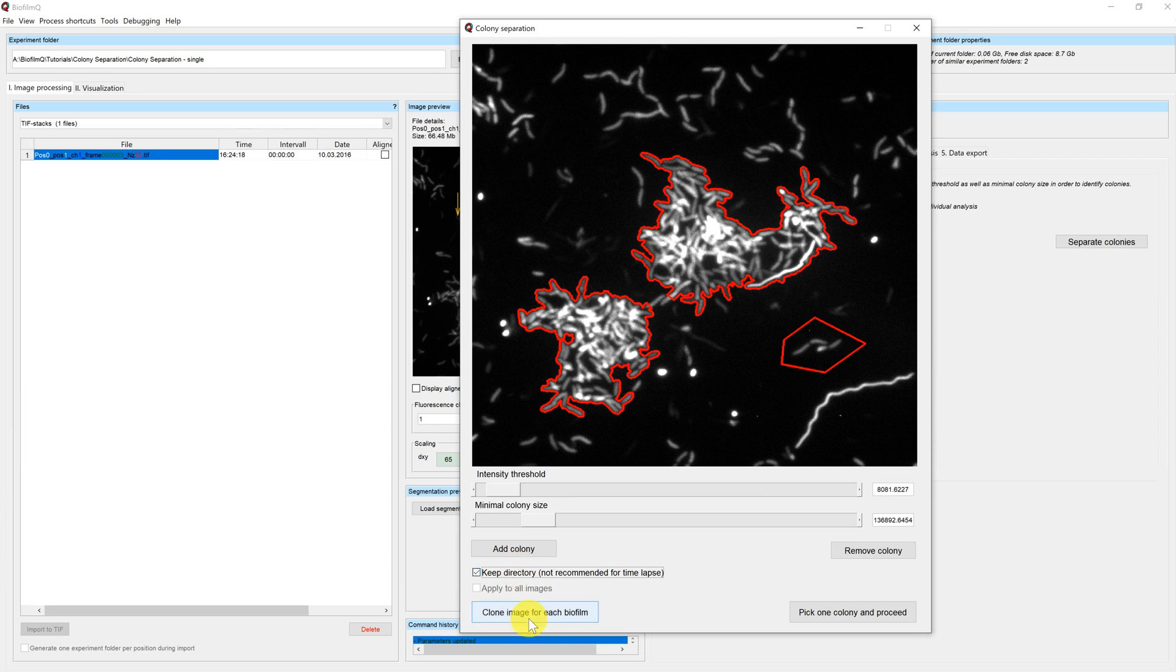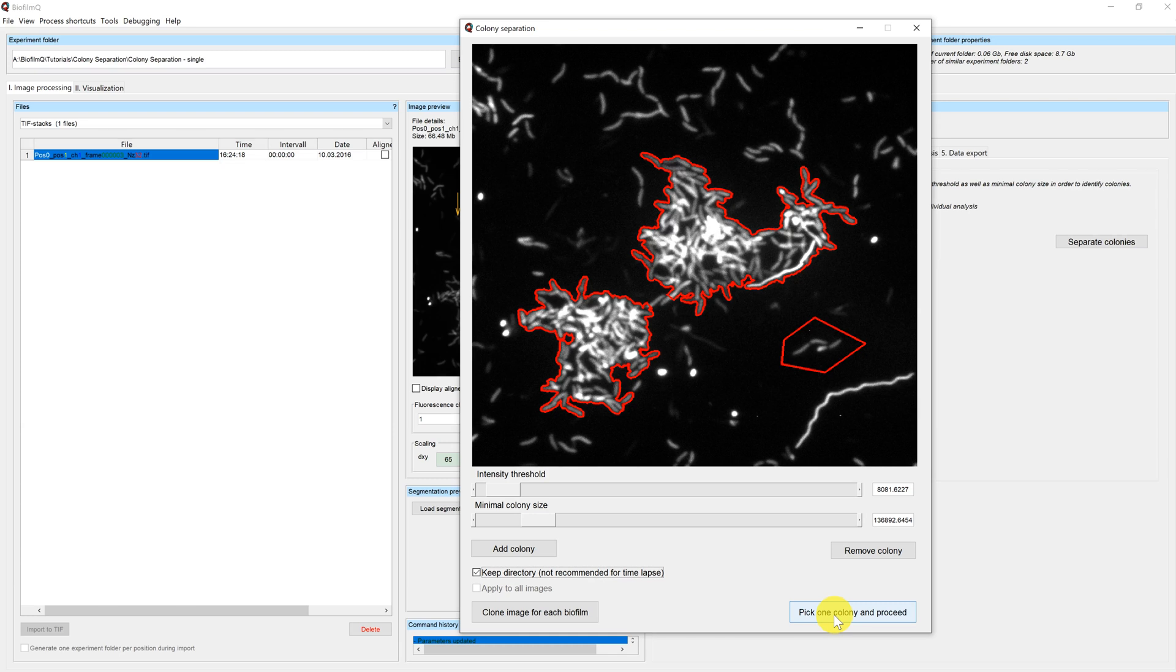You can either create a new image for each microcolony in the selection or pick one colony and proceed. In this case, we want to clone the image for each colony.